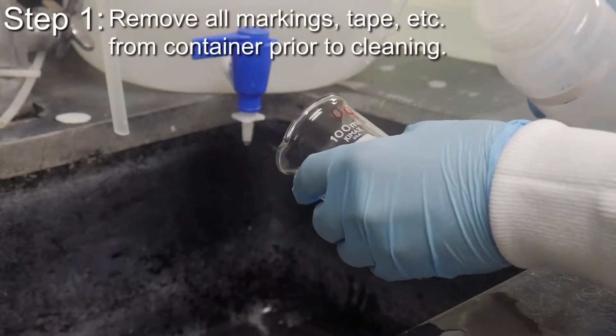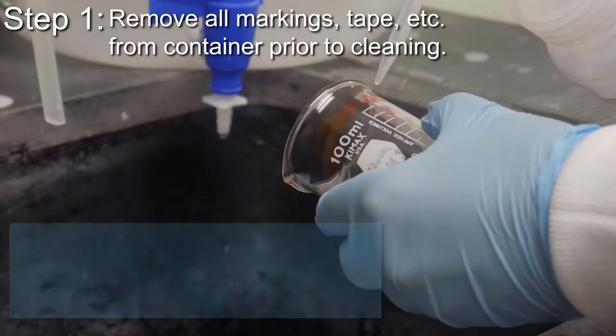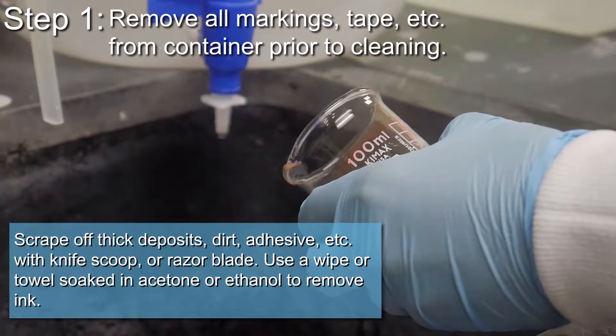Remove all markings, tape, etc. from the container prior to cleaning. Scrape off thick deposits, dirt, adhesive, etc. with a knife, scoop, or razor blade. Use a wipe or towel soaked in acetone or ethanol to remove ink.